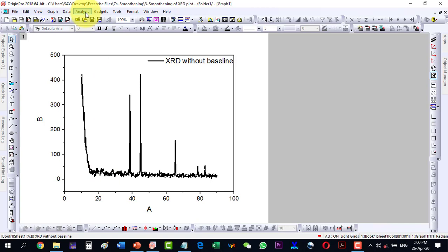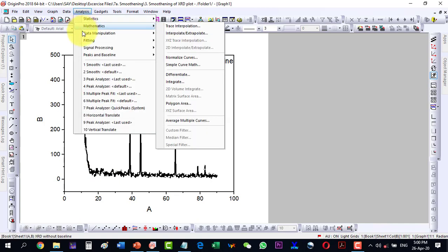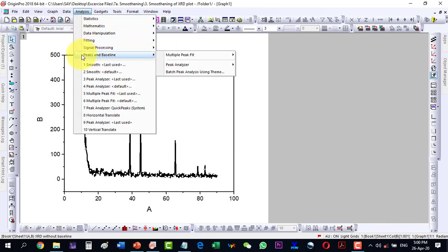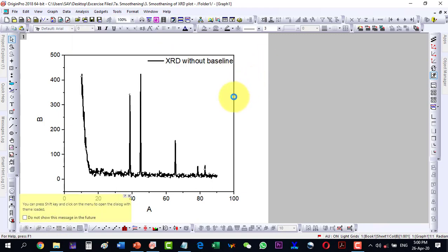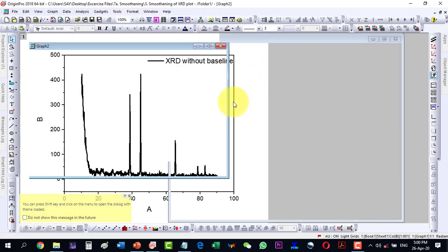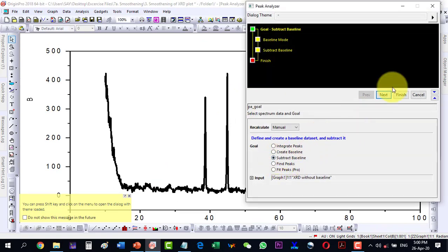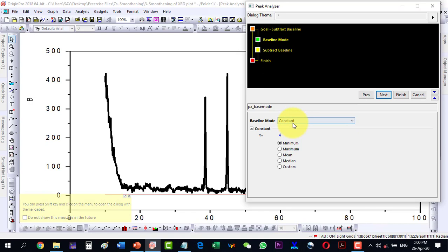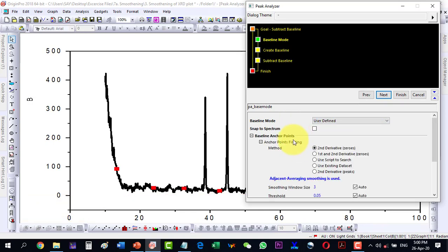So the very first thing, I select this and I go to Analysis, and then to Peaks and Baseline, and I correct its baseline. And here I say Subtract Baseline and go Next, and I select a User Defined mode.